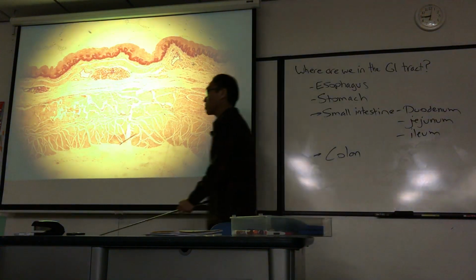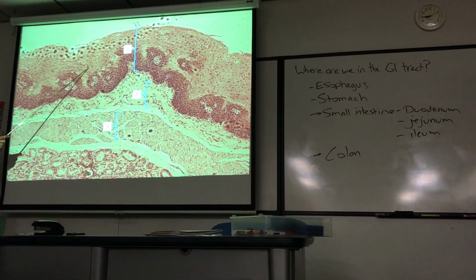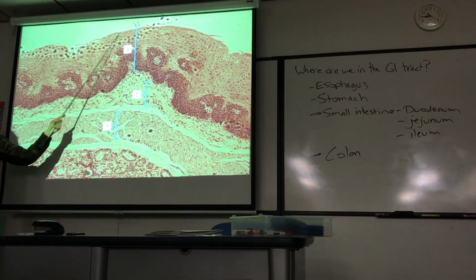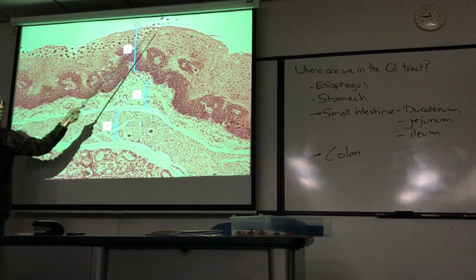There it is unlabeled. Here's a closer up picture of mucosa. The mucosa, number 1 is the epithelium. This is a stratified squamous epithelium. So, you swallow your food, you didn't chew very well, you have sharp potato chip shards, and this is for protection, right? You can slough off the apical layers, and the basal layers will replace it. Well, anyways, stratified squamous epithelium, number 1.